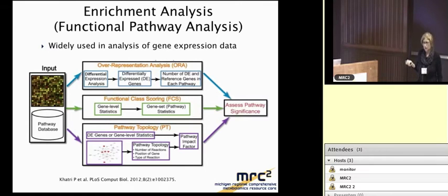So basically, the simplest bioinformatics task that you might do, once you have identified your differentially regulated metabolites, is to take this image and put your differentially regulated compounds on this pathway, okay? If you tried that, you know that it can be tedious and time consuming, and this is probably not the way to go, especially for a large metabolomics study and a large data set.